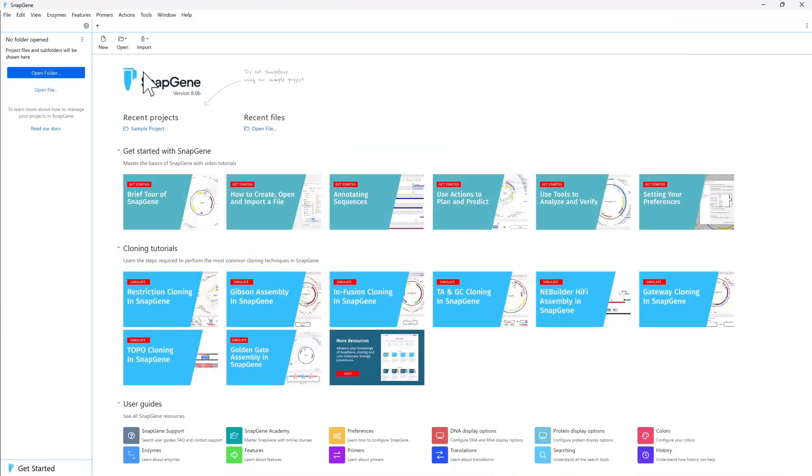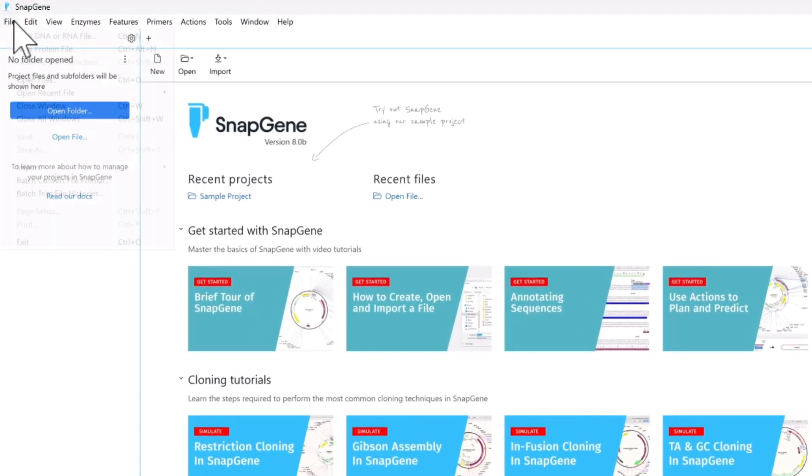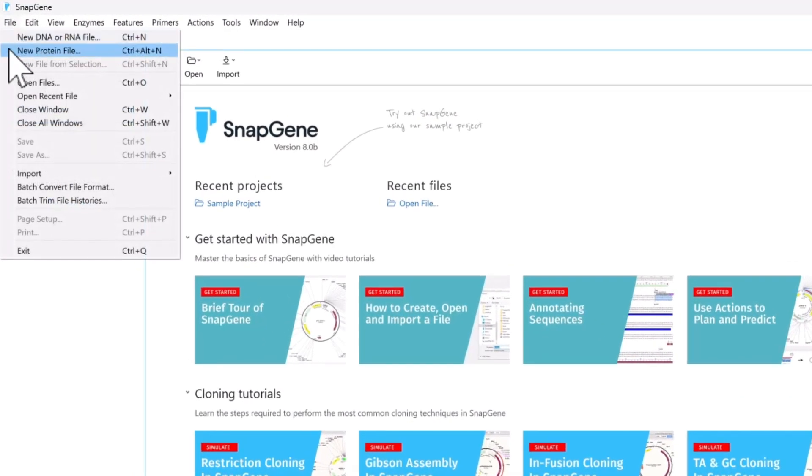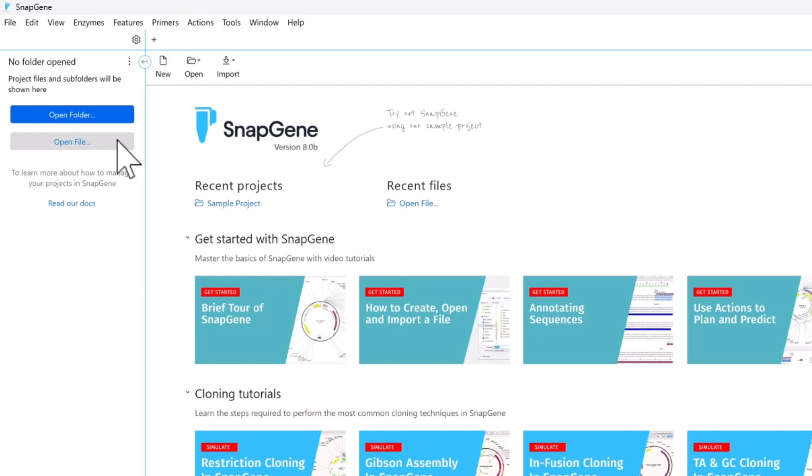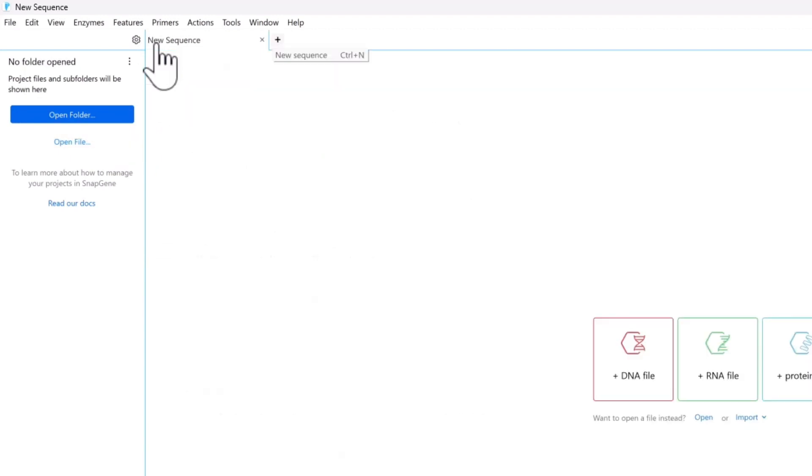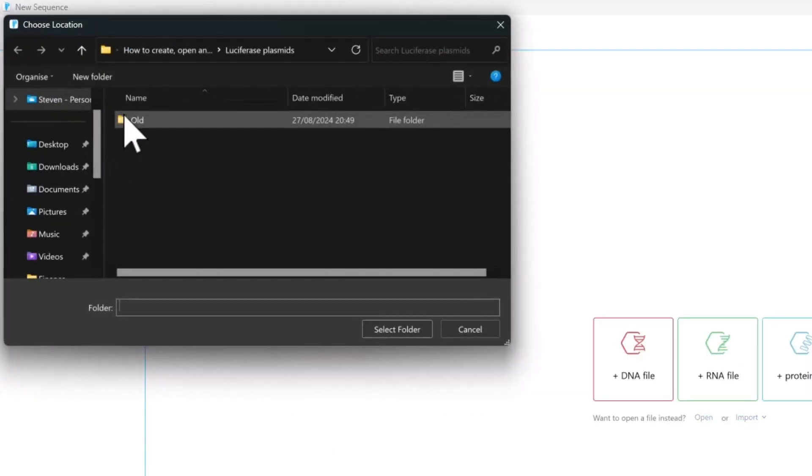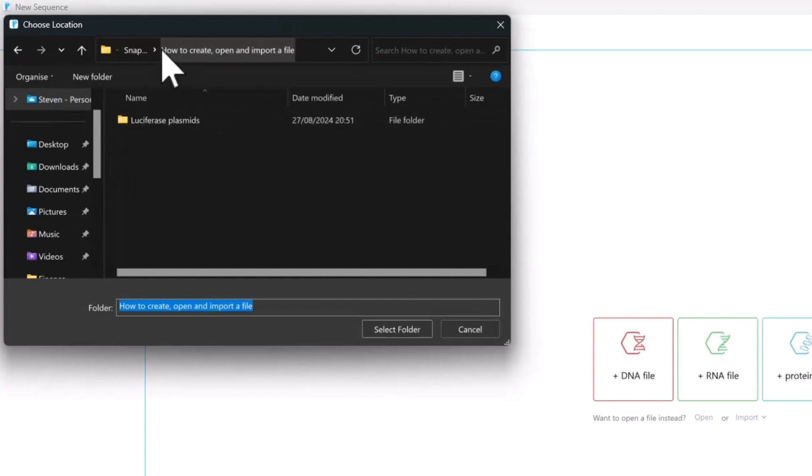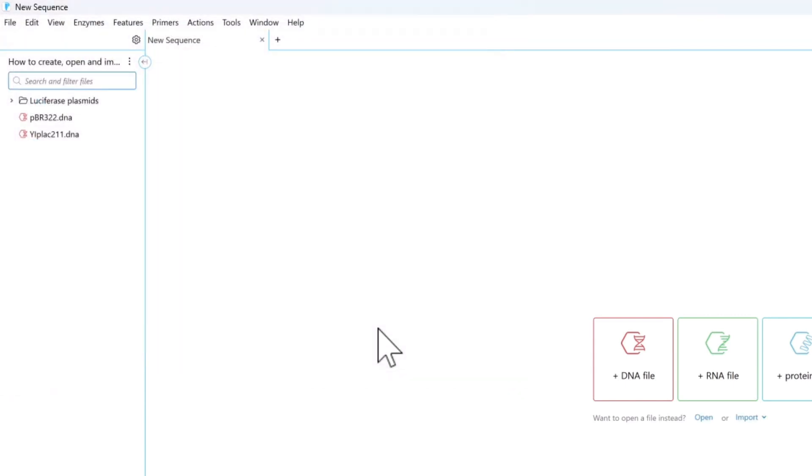You can open existing files from the top toolbar, the project side panel, or by clicking the plus button at the top of the screen. If you have a folder containing multiple sequences, you can also open that project folder as a project.